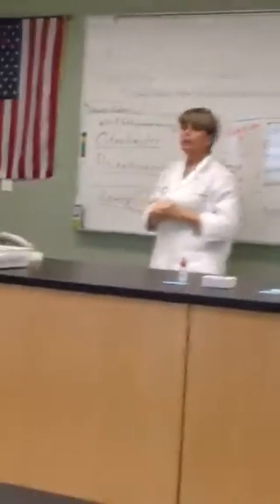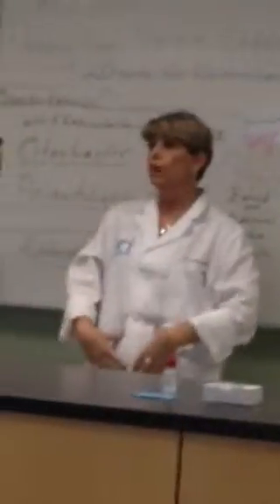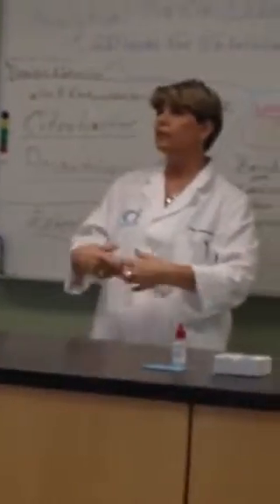Okay, let's do this. Family Enterobacteriaceae are gut flora, might be human gut flora, particularly the bowels. That's why they call them coliforms. Friendly lactose fermenters, coliforms, normal human coliforms. E. coli and his friends.